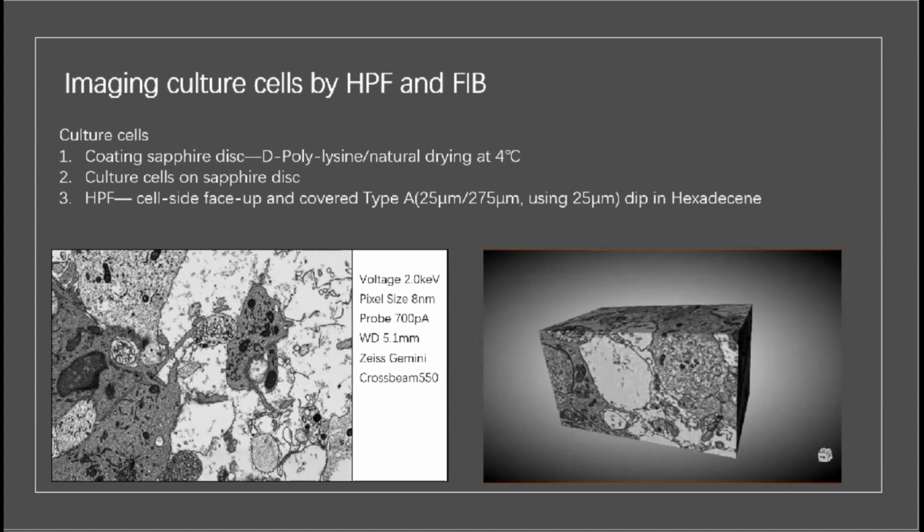I have a question, Lei. So you showed some of the images of samples prepared regularly without using ROTO, the reduced heavy metal staining method. In your experience, is there some specific sample that really needs this heavy contrast, or some certain sample that can go without special heavy metal staining? Yes. Some people think not using the staining is better.